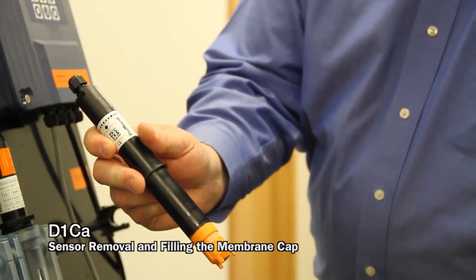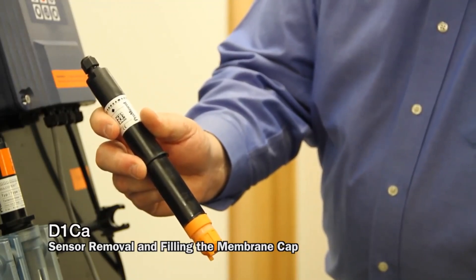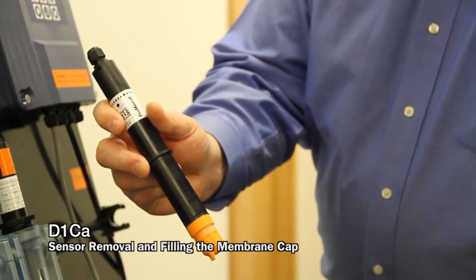Viscous electrolytes tend to take a little bit longer to energize, so you will have to wait a little bit longer before doing your calibration.